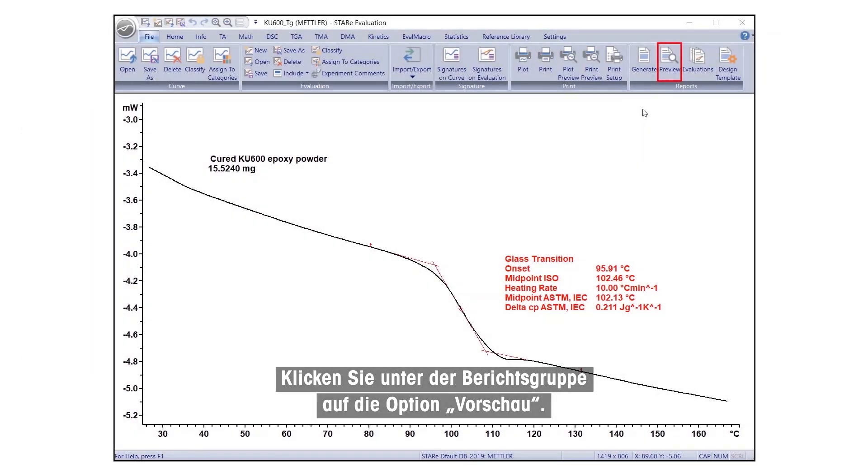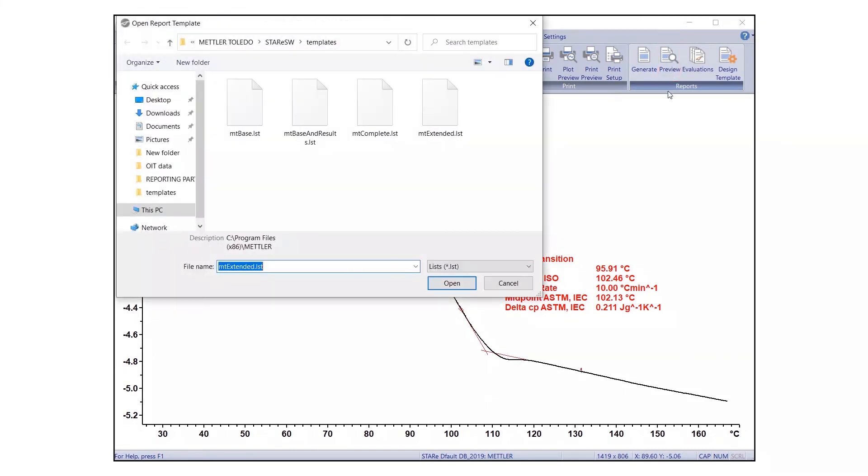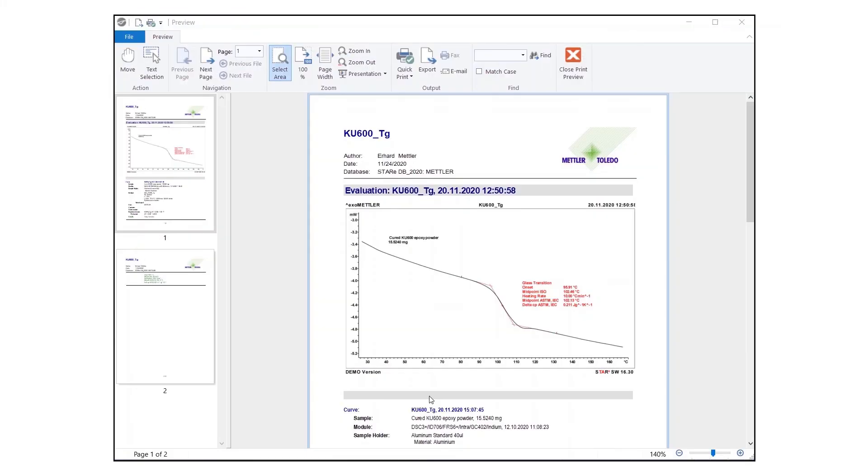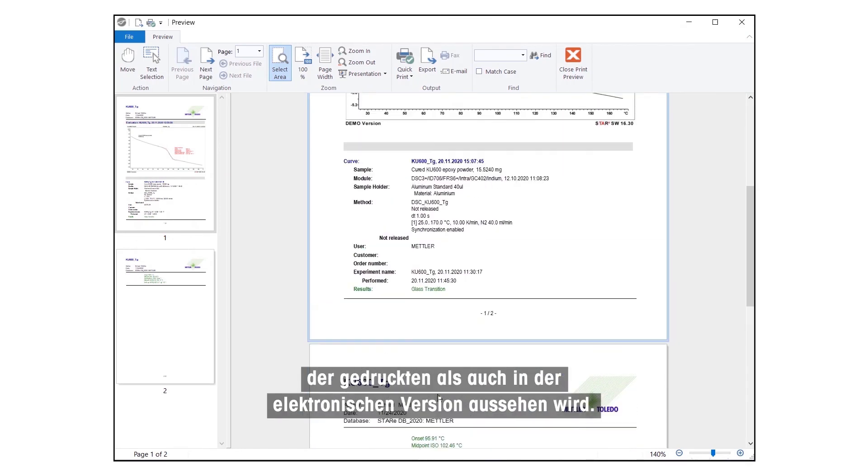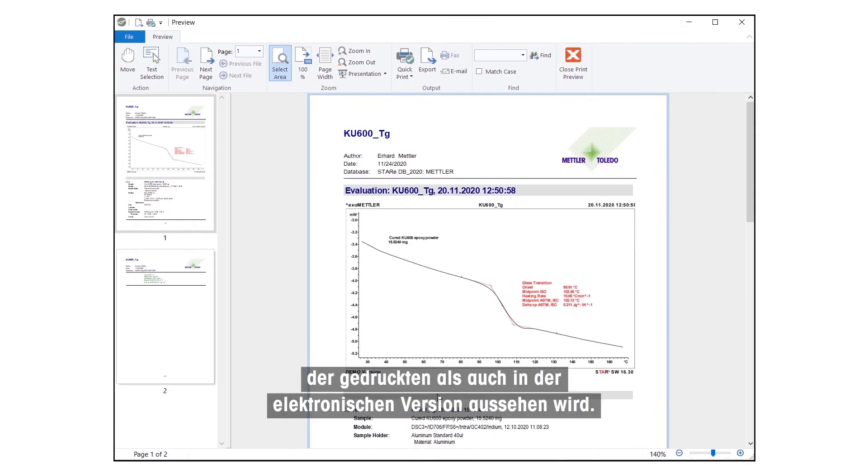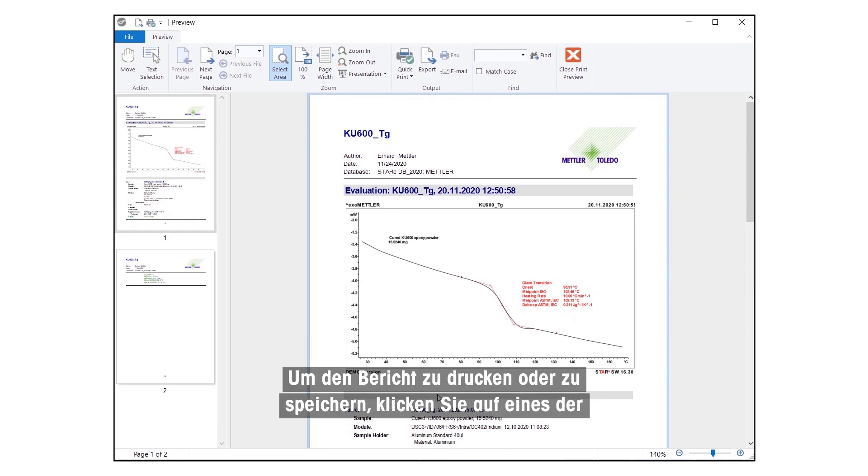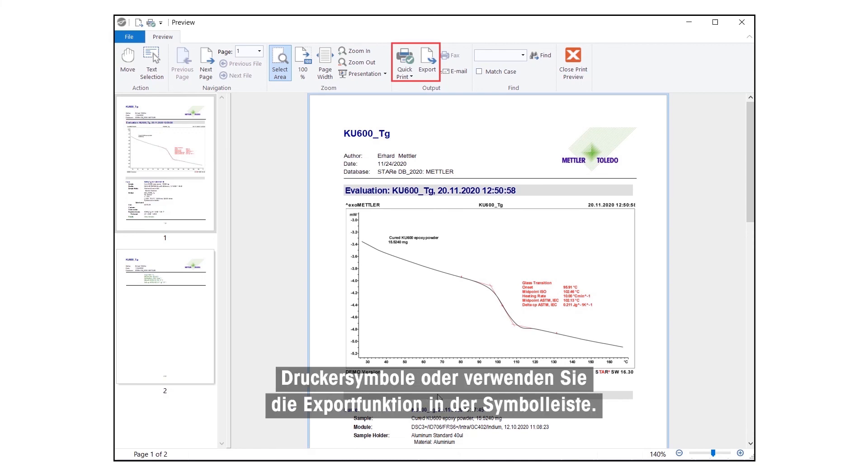Under the Reports group, click on the Preview option. The report is displayed in the Preview window, as it will appear both in the printout and electronic version. To print or save the report, click one of the printer symbols or use the Export feature located in the toolbar.